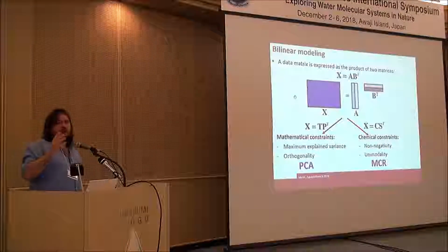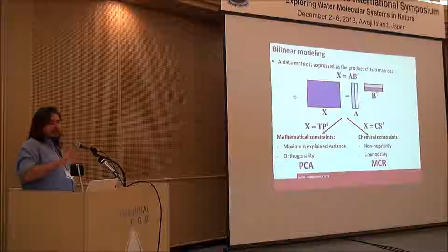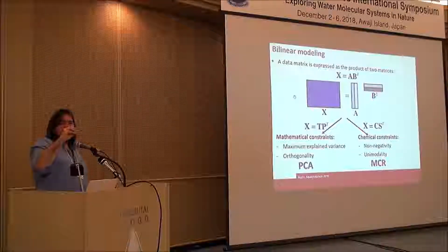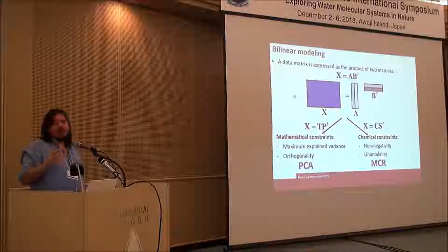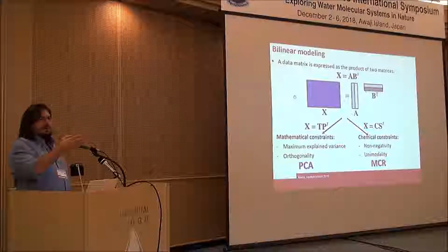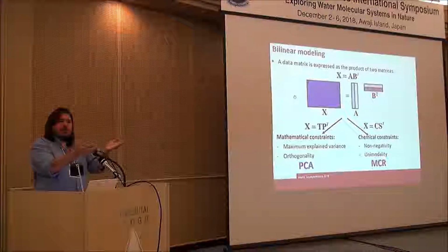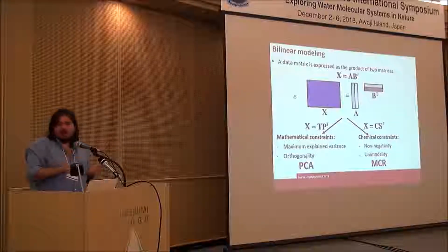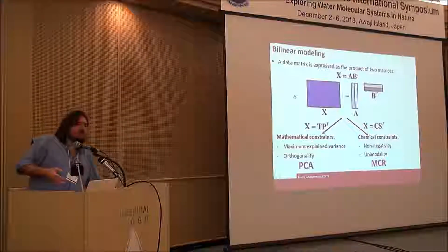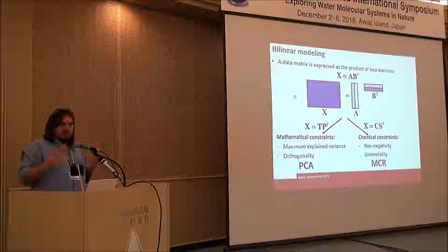We must be very honest with respect to one another in the sense that, of course, MCR, I will go very quickly, I will skip some slides and go very quickly about some specific chemometric details about the algorithm, but MCR is still, in a way, a least squares method. It means that even if we do not directly cover the direction of maximum variance, still it will try to give us relevant profiles that are relevant to describe the variability in our data. So we will not get as a first component something that explains 0.01 of total variance. Otherwise, we would be completely misled in our interpretation.